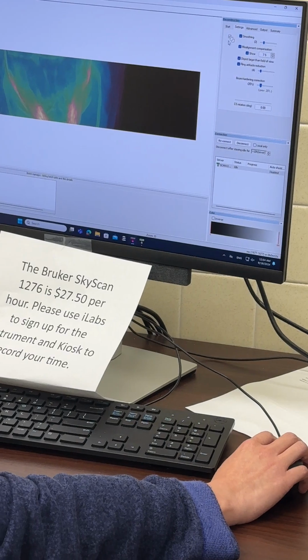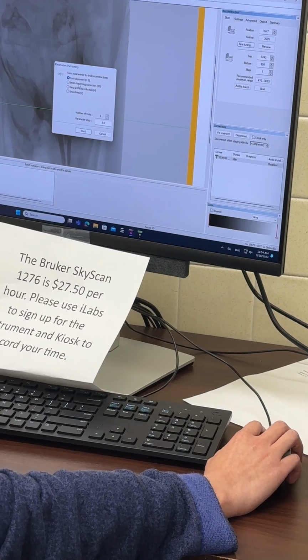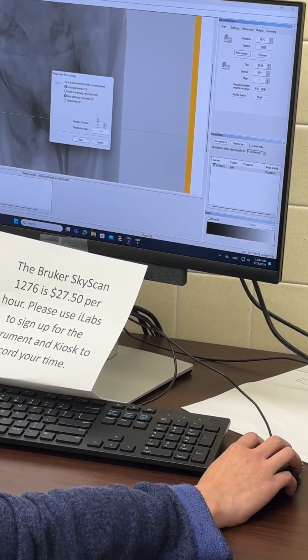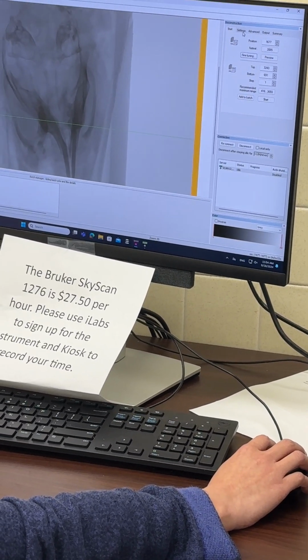Change this one. We go here, start, click fine tuning here. Then you can pick whatever parameter you're going to set, and you can use this one to adjust the step. Let me think about it. Let's do it one by one.